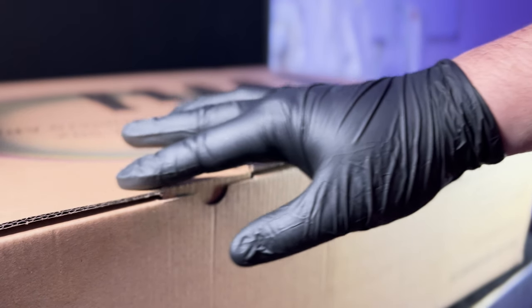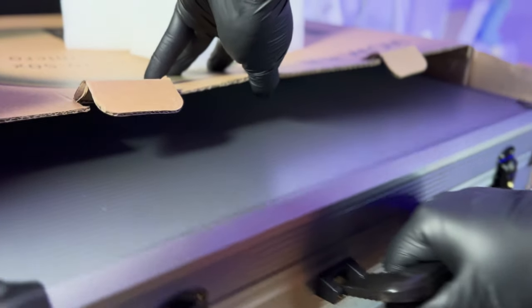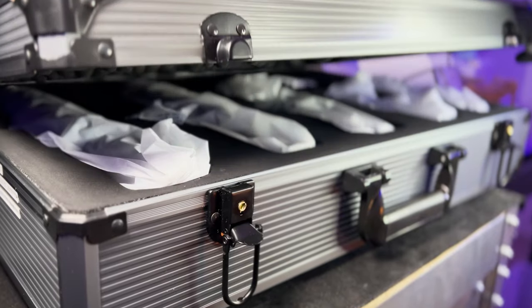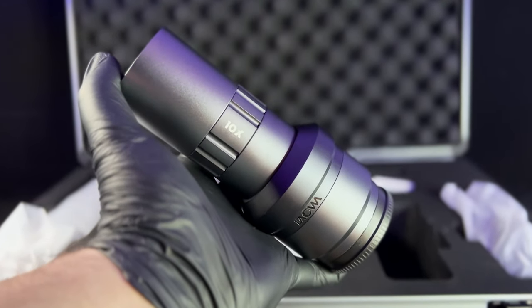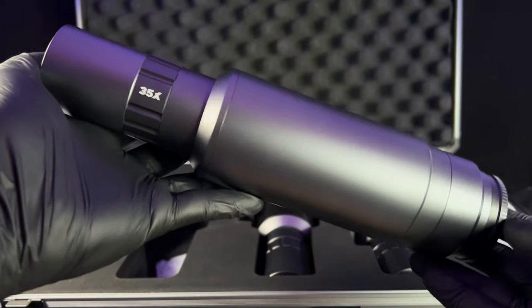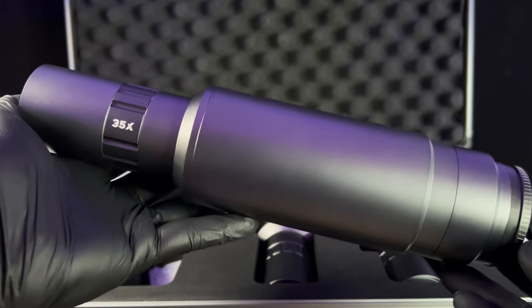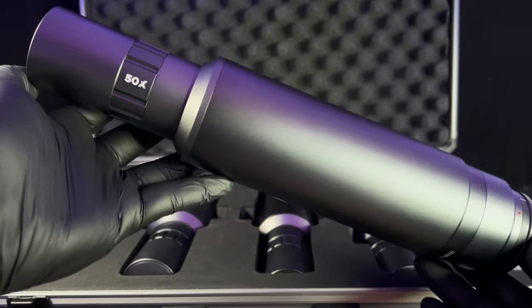So these are the Laowa Supermicro lenses, designed and brought to you by Laowa Venus Optics. Of course there has to be an unboxing. Oh hot dang, these are nice! We have a 10x magnification tube lens, we have a 20x magnification tube lens, we have a 35x magnification tube lens, as well as a staggering 50x magnification tube lens.